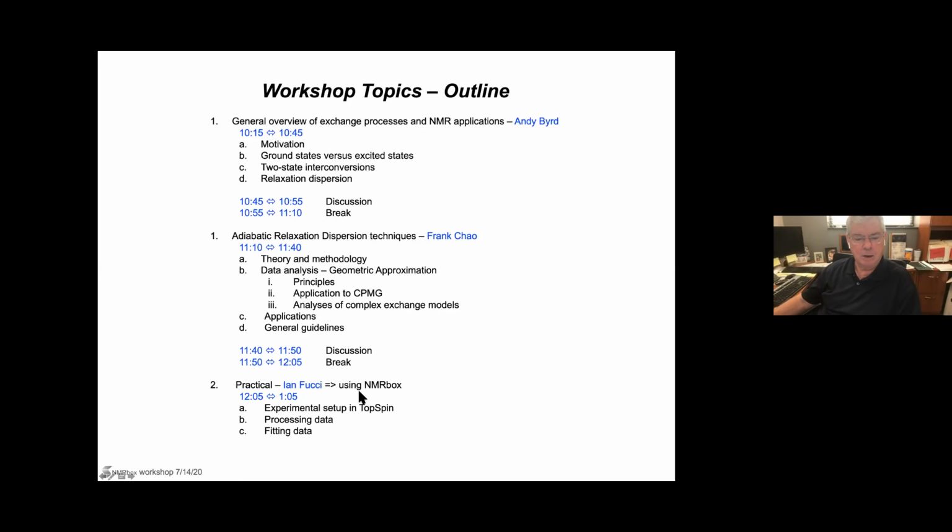And Ian, a current postdoctoral fellow in the lab, is going to actually do a practical and show you a little bit about experimental setup and processing data and fitting data. And all the software is going to be at NMRbox. That's where it is, and people that have used this before. Okay, so that's the brief outline.